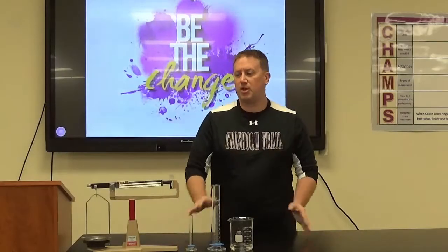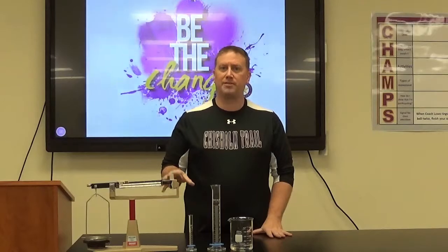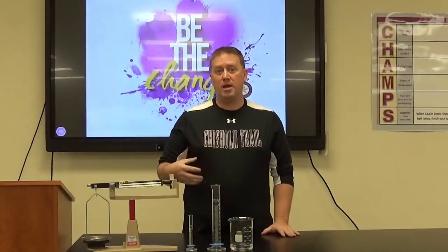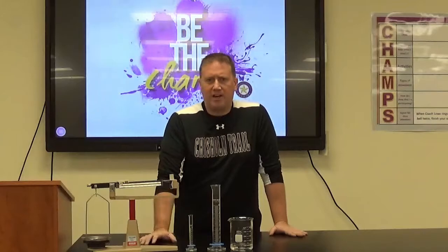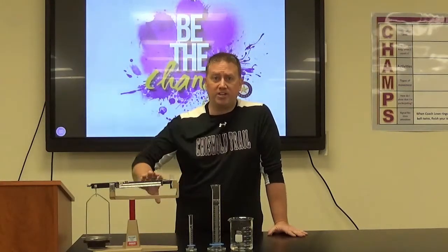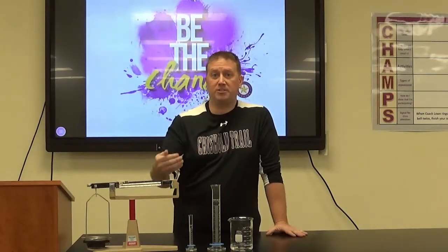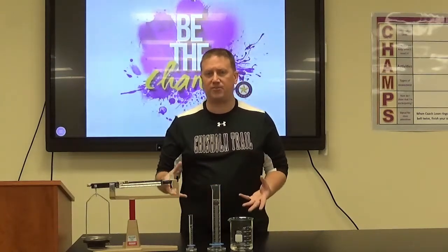Hey everyone, so today we're going to look at how to use different pieces of equipment. These are pieces of lab equipment that you'll be using throughout the year or will be referencing throughout the year. And so we need to take a look at how to use each of these pieces of equipment, and we're going to tie that into the idea of precision and accuracy while you're taking measurements for any of the labs, for any of the chemistry stuff that we're doing.